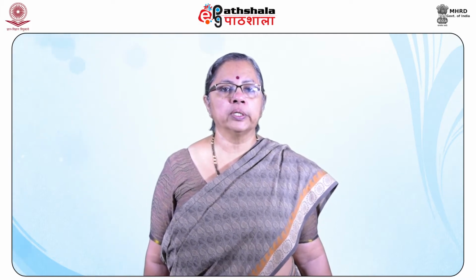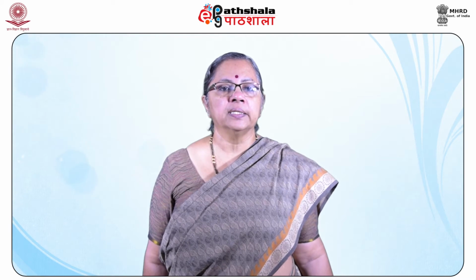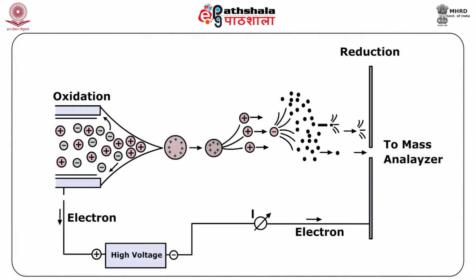The spray contains fine droplets of the macromolecules from which the solvent rapidly evaporates as a stream of dry nitrogen or any other gas is passed. As the solvent evaporates, the peptide or analyte is in a gaseous ionic form with a charge of plus 0.5 to plus 2 per kilodalton, and these can then be analyzed by the mass spectrometer. The principle of ESI is best illustrated in the alongside diagram.